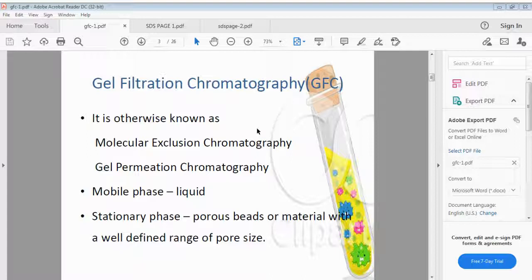It can also help in the removal or exclusion of those small sized protein molecules from the gel to be eluted out in the end. Okay, so this mobile phase which is trapped inside the gel is called the mobile phase present inside the gel. And the total mobile phase which is present inside the column, that is the mobile phase trapped inside the gel and the mobile phase present in the intermolecular spaces, together is called the total mobile phase. When you take the stationary phase inside the column, it is the bed. Okay, you call it the column bed.